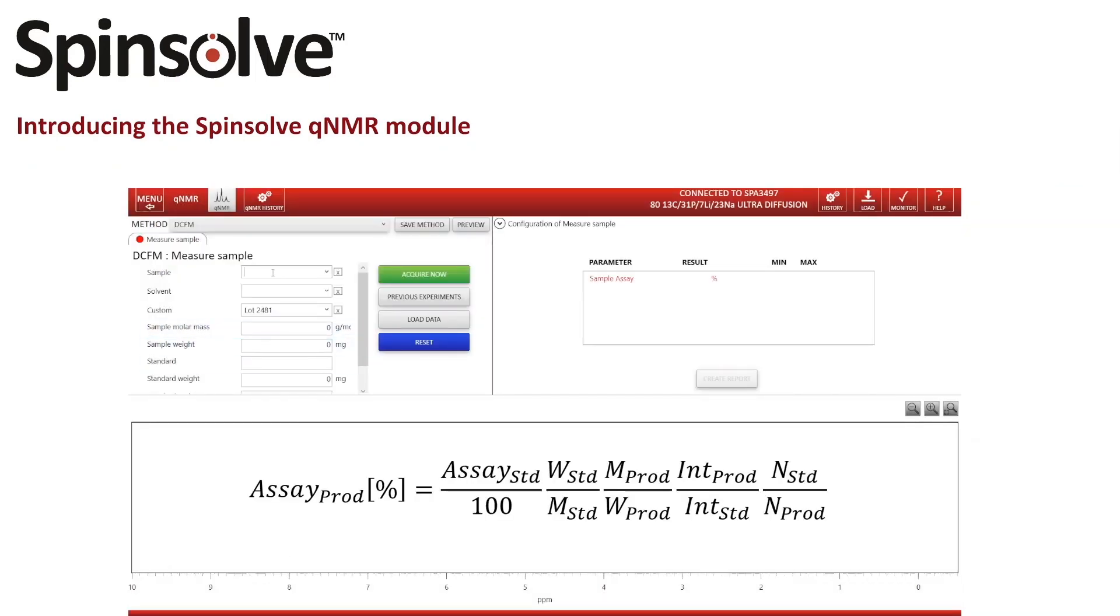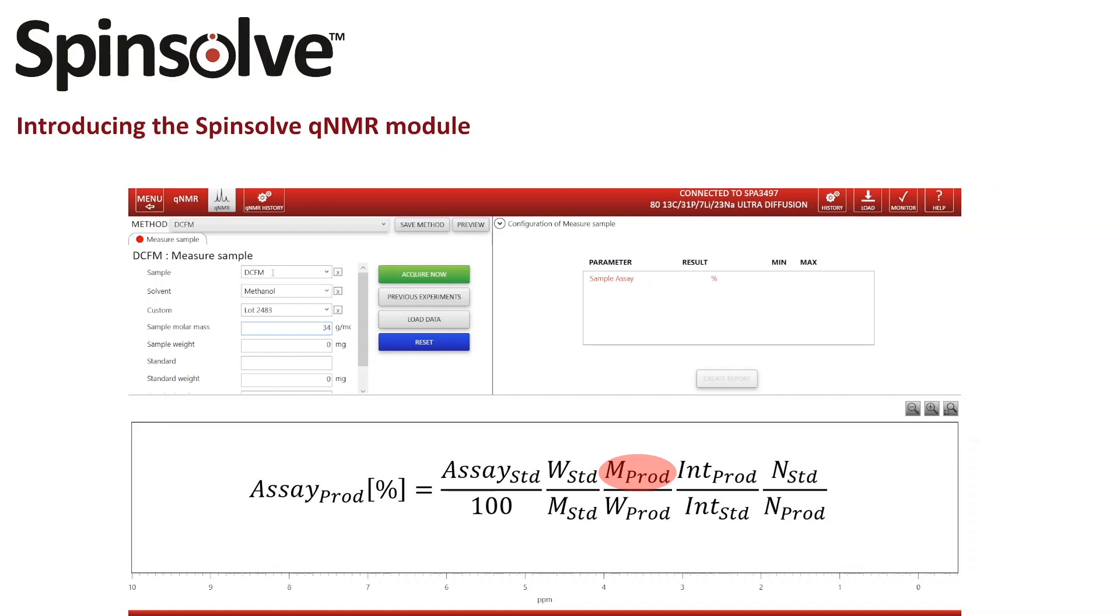Now I can fill in all the sample information. For example, the name of the sample, the solvent which was used to dissolve the substance, the lot number or another information which is unique to the sample, the molar mass of the sample, and the amount of sample which was used.